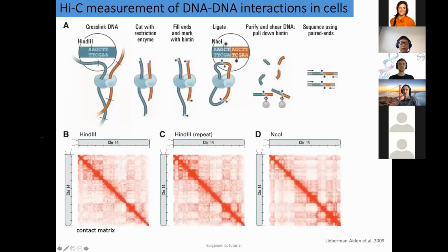Now, of course, if you're lucky or you work on a cell type where people have actually measured DNA contacts with Hi-C data. So I just want to briefly mention this. This is a protocol where you're linking regions of DNA that get in contact. So basically you're crosslinking this and then you cut it and then you sequence those parts. And now you have the 2-part sequences that basically get in contact.